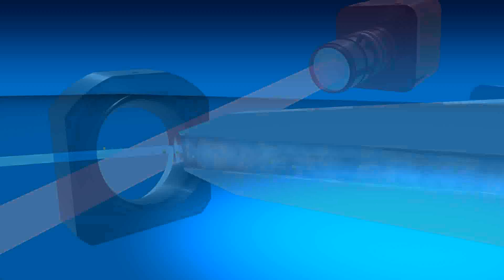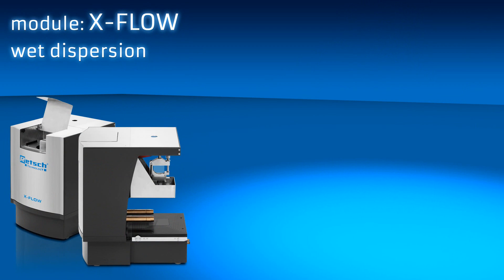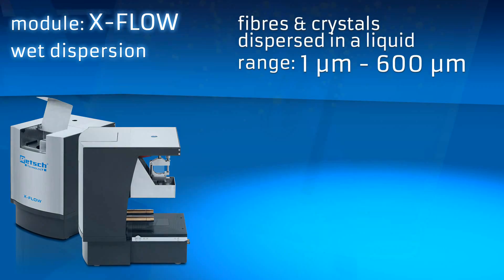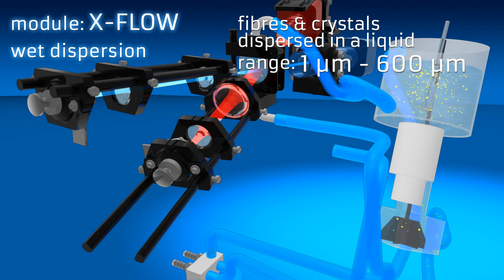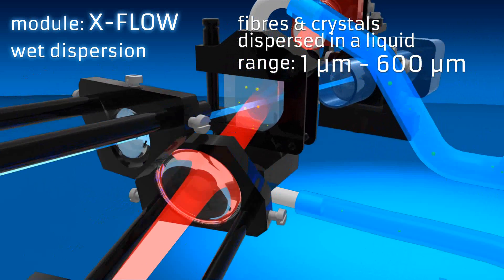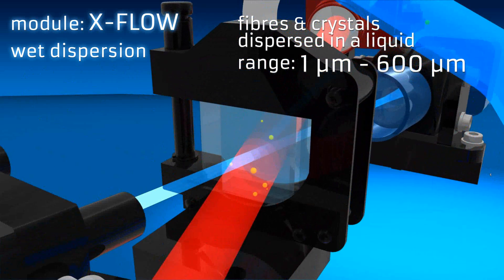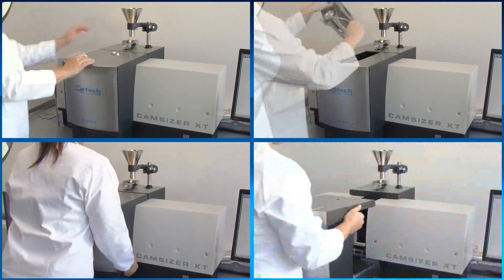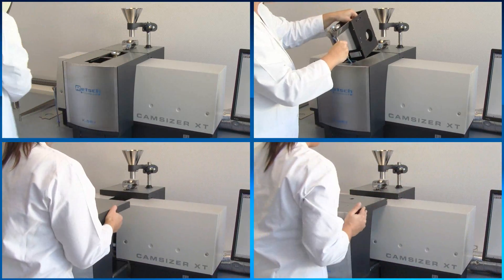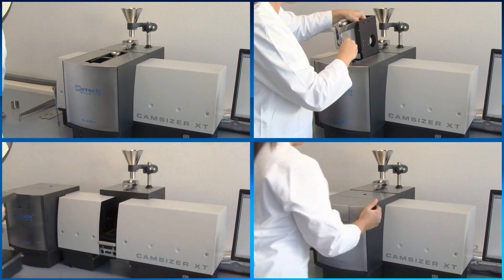With the X-Flow Module, the CamSizer XT offers the possibility of wet dispersion of particles in a range from 1 to 600 micrometers. Sample materials like fibers or crystals are dispersed in a liquid and circulate through the measurement system. Thanks to the exchange system of the CamSizer XT, the three dispersion units can be exchanged quickly, safely, and without effort.